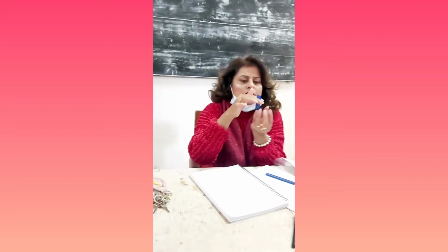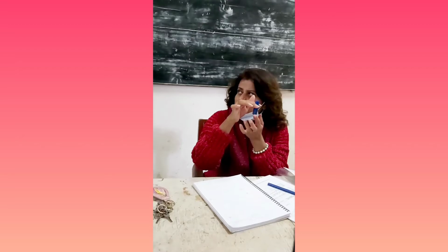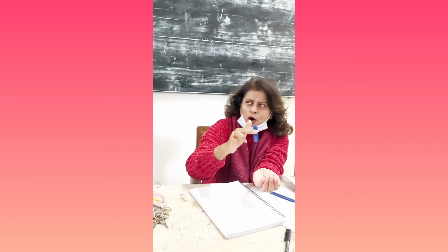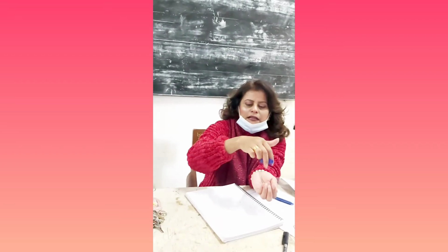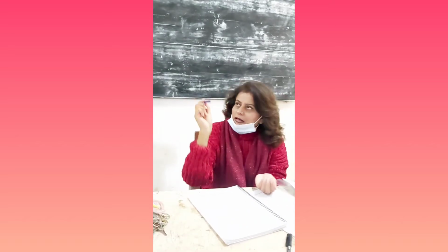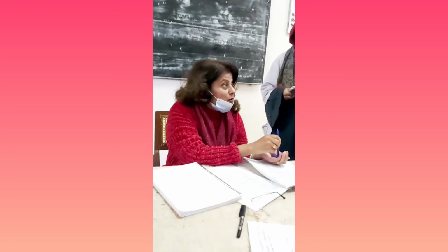Okay, now when the tube becomes red hot, at that moment you have a china dish at one side containing 20 ml of distilled water, because now the second portion, the extraction process, starts. You are going to drop your red hot ignition tube into it, like this, that's it, right? And with the help of a glass rod, not a spatula, a glass rod, you are going to hold it and crush your burnt ignition tube into small pieces, right?